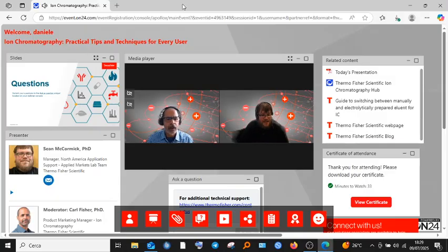Another would be something like ICP-MS. You can get, again, speciation analysis, better quantitation, more diverse analyte detection, and really more information. There's lots of different detectors you can plug into an IC, and other techniques you can hyphenate in, things simple like UV. We use electrochemistry and conductivity all the time, and you can go even further. We're seeing work in FTIR. There's lots of people connecting ICs to different backends to be able to get a more complete view of their samples and learn a lot more and dig deeper into them.